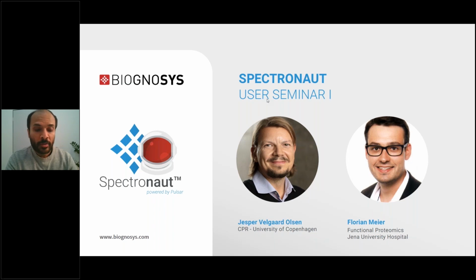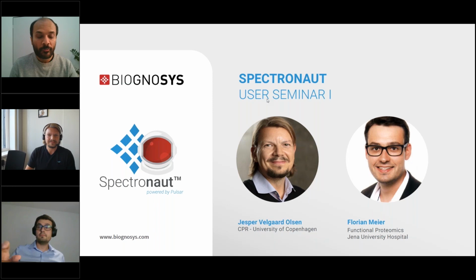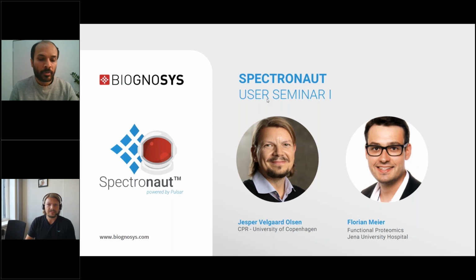It is also very interesting for me, as our team has invested a lot of effort in supporting ion mobility data in the latest version of Spectronaut. So first up, we have Jesper Olsen, who will be talking about doing DIA with FAIMS. Jesper is a full professor at the University of Copenhagen and vice director at Novo Nordisk Foundation Center for Protein Research. He has made several important contributions in the field of proteomics and high-resolution mass spectrometry, especially for quantitative phosphoproteomics and its biological applications.